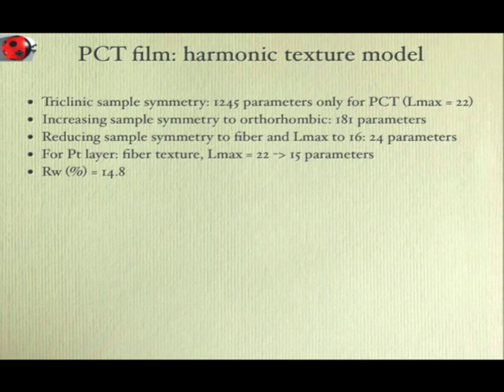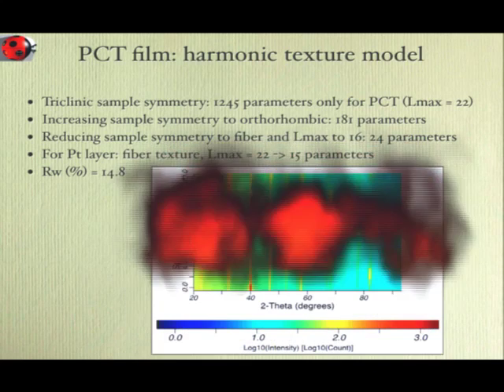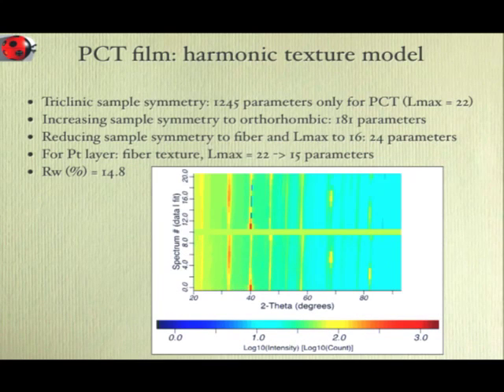Oh no, okay, there is one problem. Here you apply the harmonic method, and you will see that in this case the harmonic method doesn't work because the texture is too sharp. Normally you use the harmonic method with smooth texture. If it is sharp, you cannot use it, so you switch to another one.